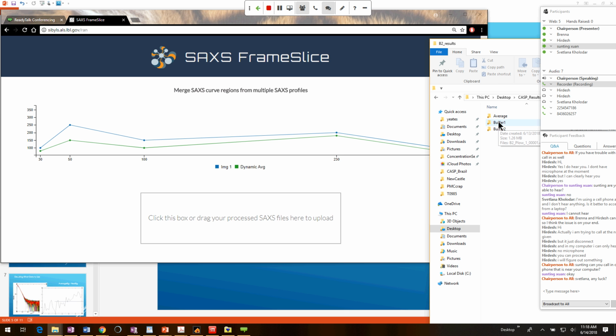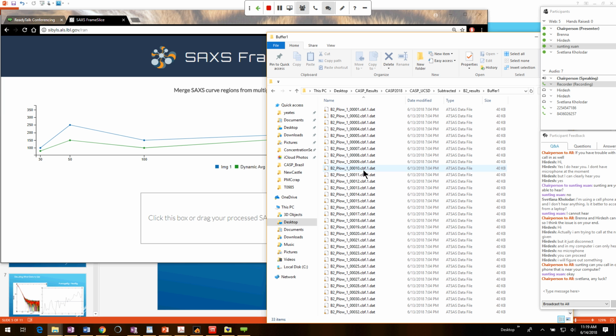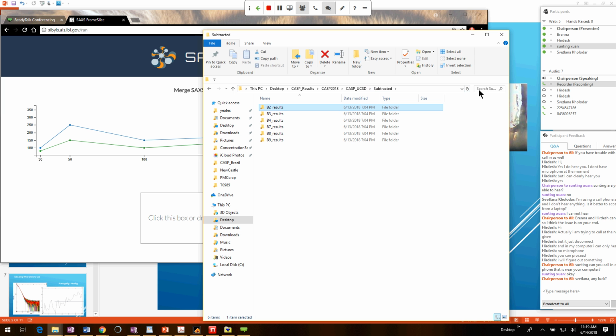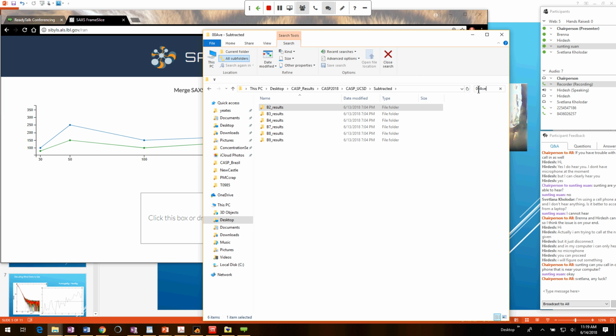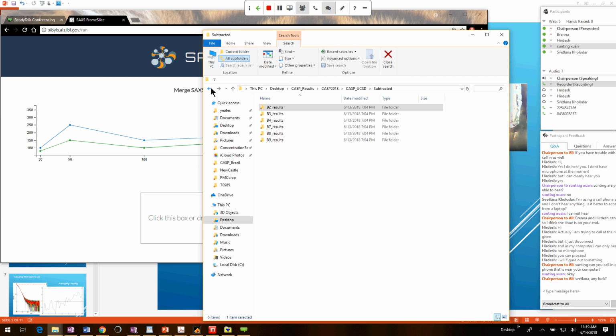Another little warning is that Catherine goes through your samples already once, and when she does that, sometimes she'll create, I guess for biologists can understand, a scar of her going through it, which is that there might be an AV data set within your structure, which you probably want to get rid of because you don't want to average her already averaged sample in there. The way I do that is to do a search for 00 AV. In this case, there isn't any, but just make sure there aren't any of those in your directory structure.